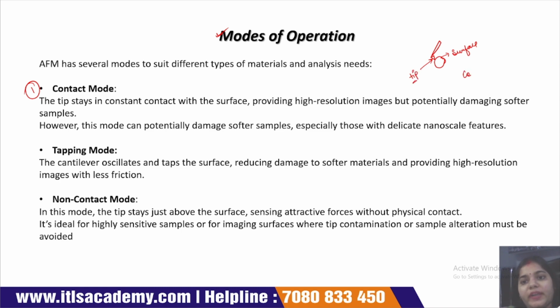In this contact mode of operation, the tip of the cantilever stays in continuous contact with the surface of the sample and provides a high resolution image.